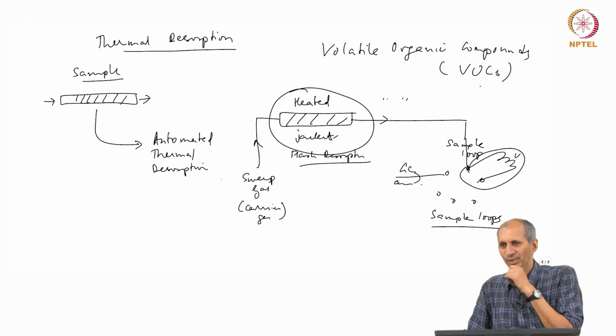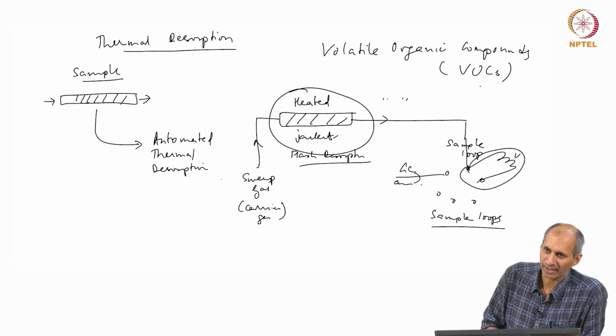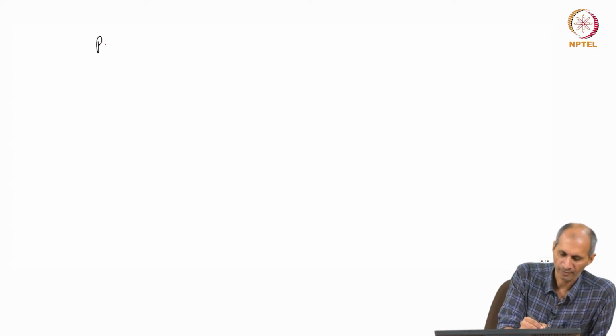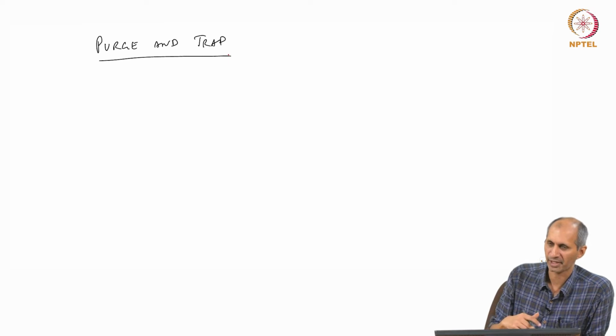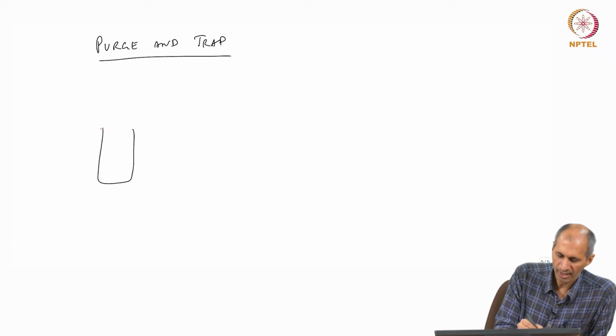So, one of the things people do is, when you are extracting, again there is the chance of losses, which are quite high. So, people do not do liquid extraction for VOCs. They use another technique called purge and trap. You will see this in the methods that you are using. This is a sample processing accessory. What this does is it takes the water sample directly and it purges it. You purge with nitrogen gas.